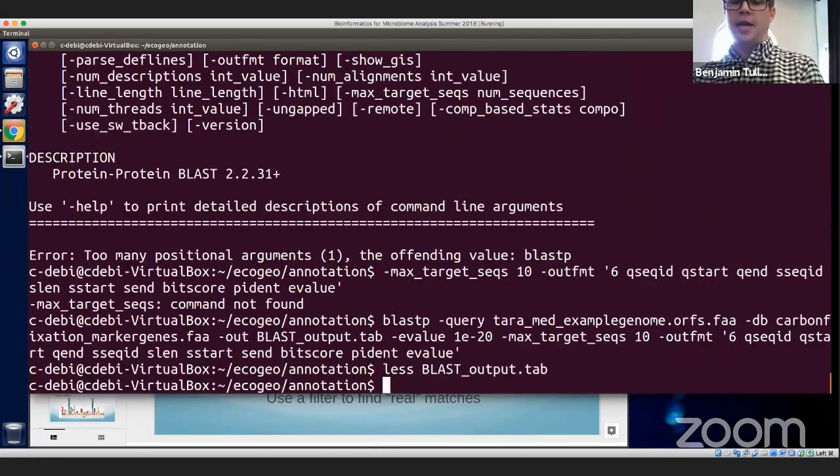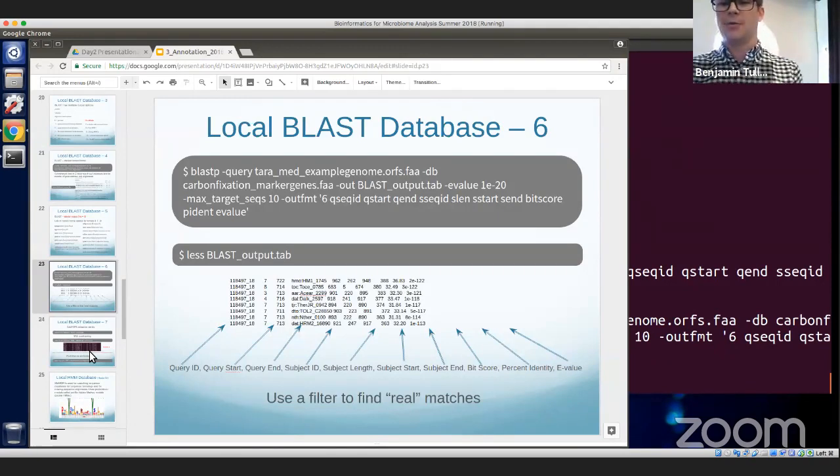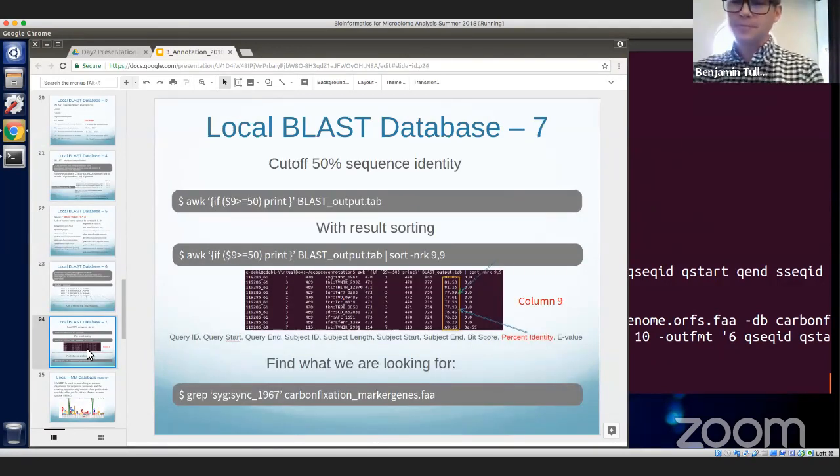If we go to the next slide, not to call you guys out, but just to explain to the crowd why, despite looking awful, this tab output is the best thing we could possibly have. Can you not add headers like yourself? You can, yes. If you wanted to add headers, you can go in and put tabbed headers in and have all that information. If you have a small enough set of information, you can take it directly and put it into Excel or something like that, which is a dreaded word for bioinformaticians, but we're all biologists, so don't tell any of them that I said that.